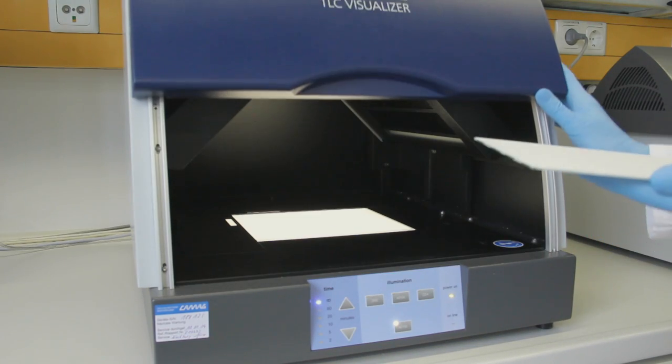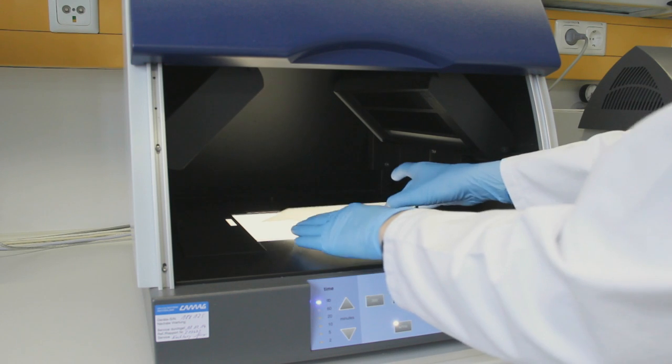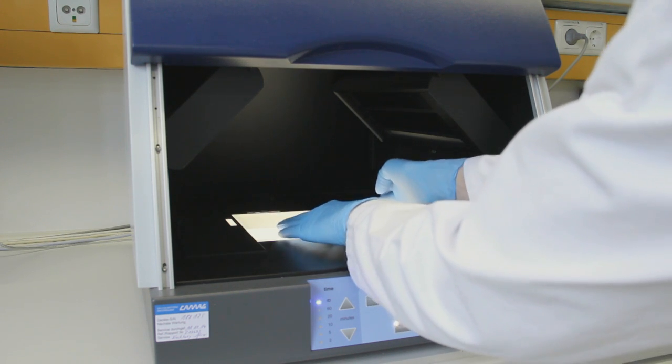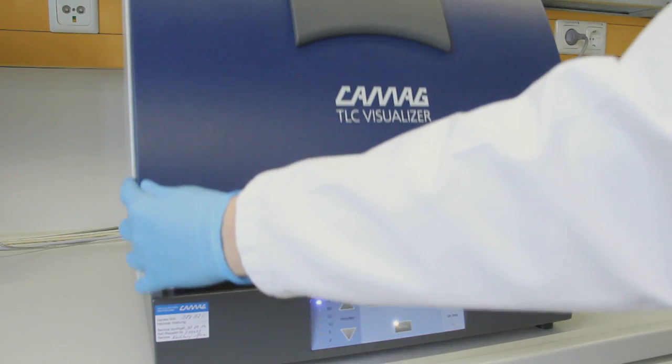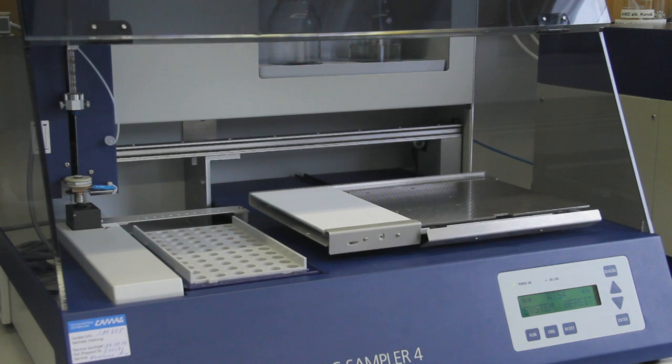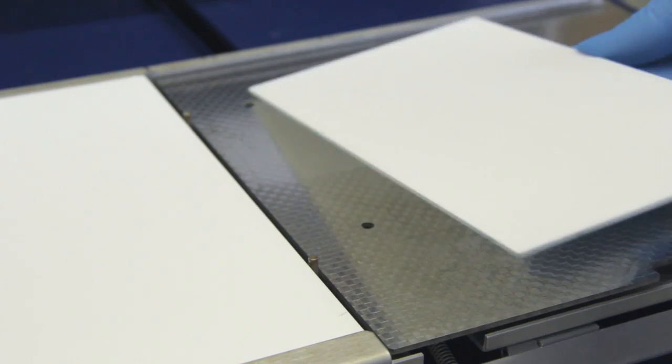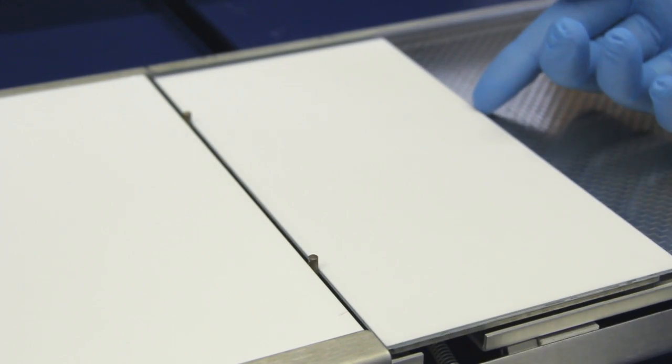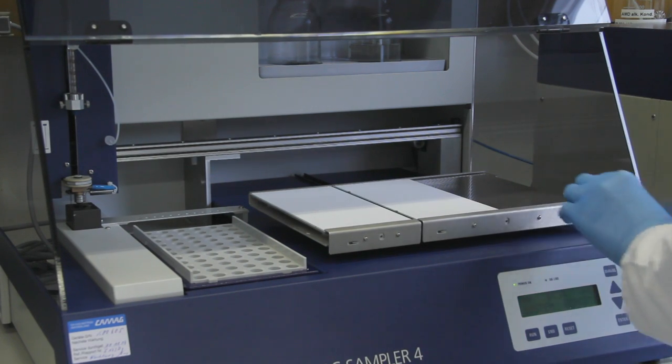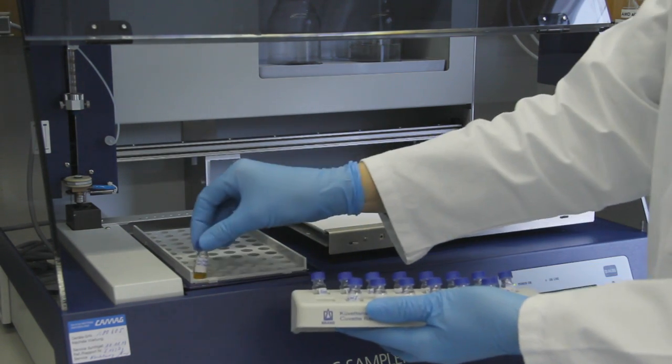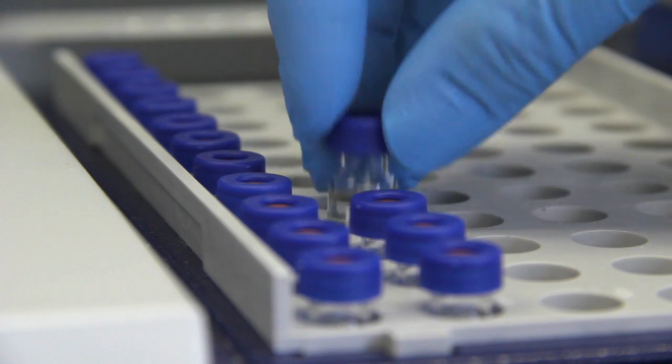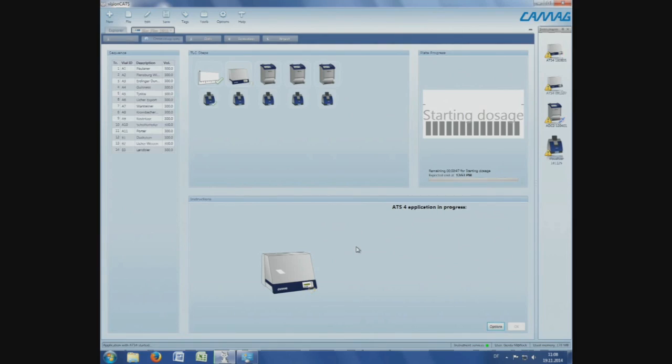Before the application, the clean HPTLC plate was documented in VisionCATS using the TLC Visualizer. The degassed and diluted beer samples were applied using the automated TLC sampler ATS-4. After positioning of the plate and the solutions into the rack, the procedure for automated spray-on application using VisionCATS was started.